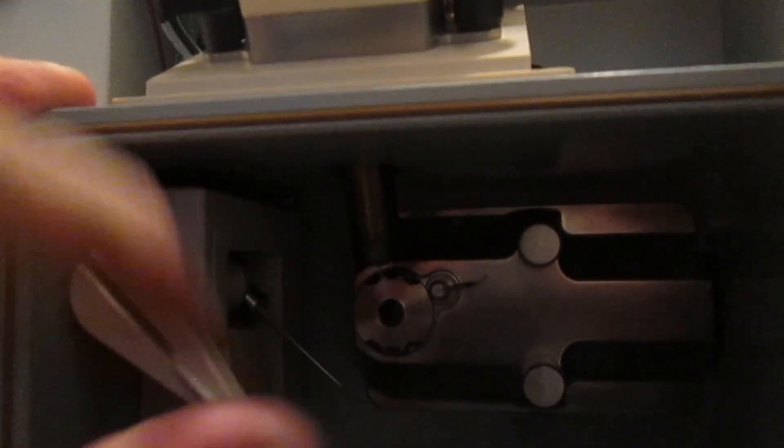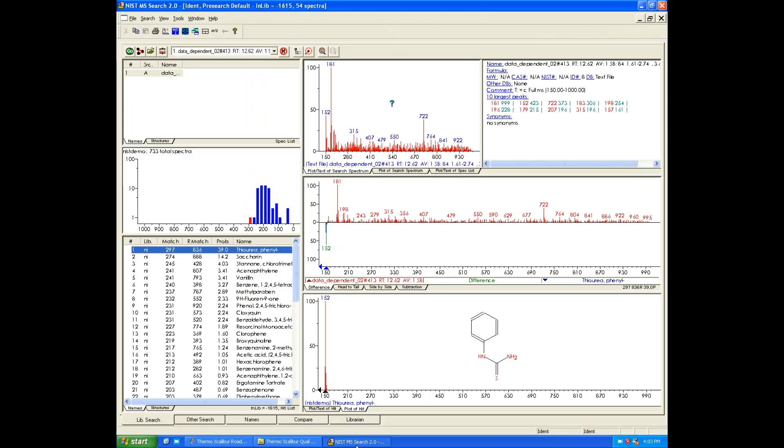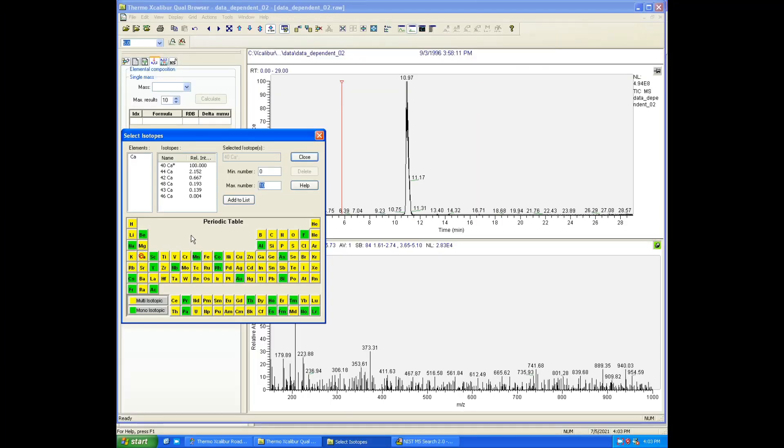Despite its age, this is a very powerful setup with amazing ability for the amateur like myself to conduct all kinds of analysis.